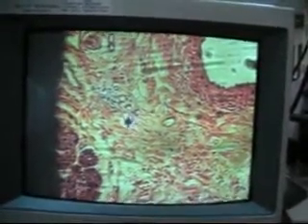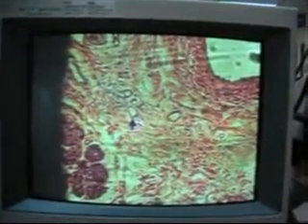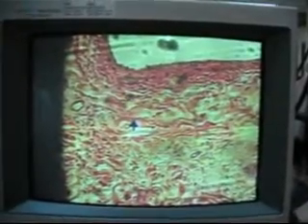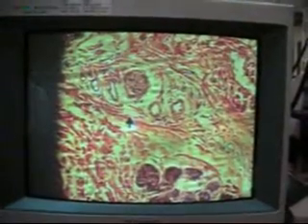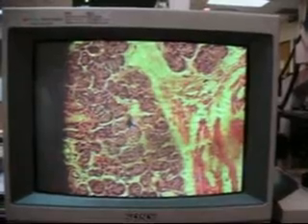This is not a capillary, but that could be a small venule, because it's hard to tell some of these things, especially if you don't have a really clear image as to what it is, but you should be able to tell the difference between venules and arterioles and arteries and veins without any problem at all. Okay, and this is a really good slide to show those differences, and there are so many of them in the connective tissue on this slide. There are so many, so it won't matter.